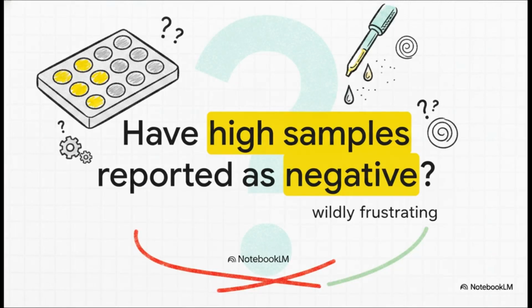So, let me ask you something. Have your highest concentration samples ever mysteriously reported as completely negative? I mean, you know the biology is real, your rationale is incredibly strong, yet your patient or study samples look suspiciously perfectly normal. It's wildly frustrating, isn't it? You naturally start questioning everything, your reagents, your pipetting technique, maybe even your entire career choice. But what if the assay isn't failing because it's poorly built? What if actually it's just completely overwhelmed?